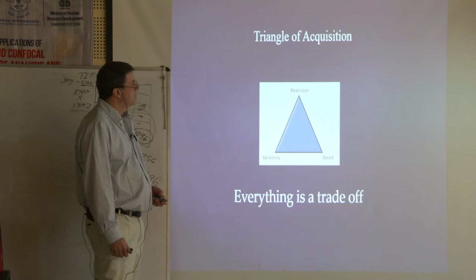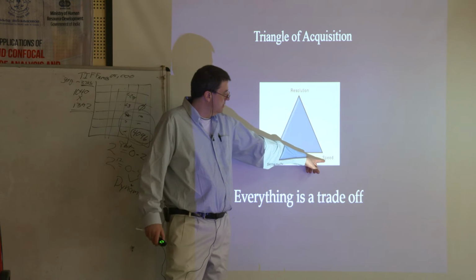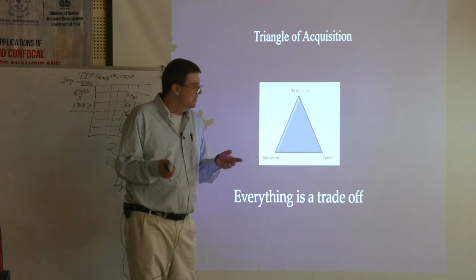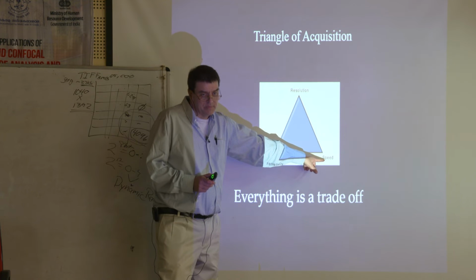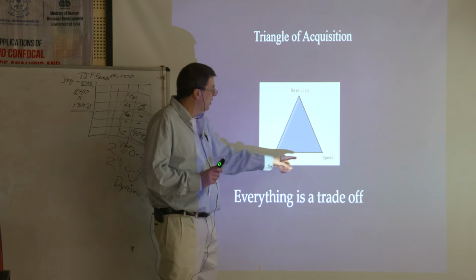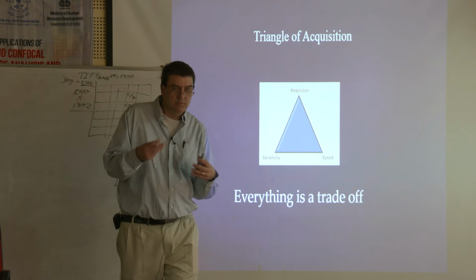The thing to keep in mind when you use a camera, like I was telling you yesterday, is that everything's a trade-off. If you want to go fast on a camera, and yesterday was the perfect example, you saw these pictures from Dr. Sinai, they weren't pretty pictures, they had very low resolution, but very high speed, because he was looking at milliseconds. So if you want to go fast, you're going to lose resolution, and you're going to lose some sensitivity. All three of these play on each other to produce an image.